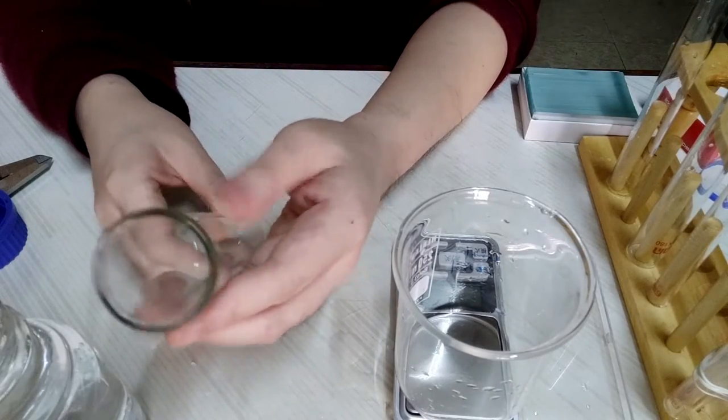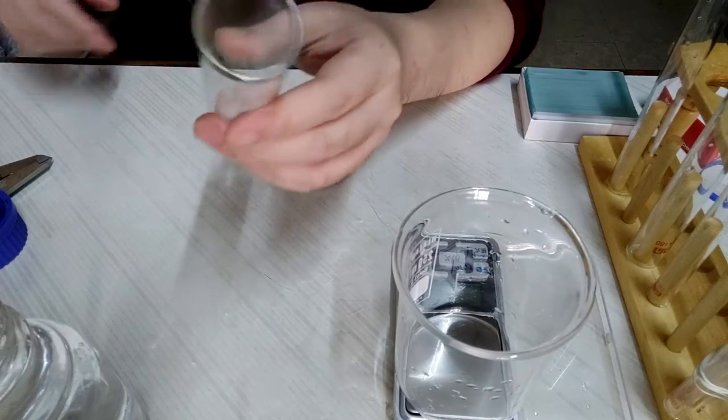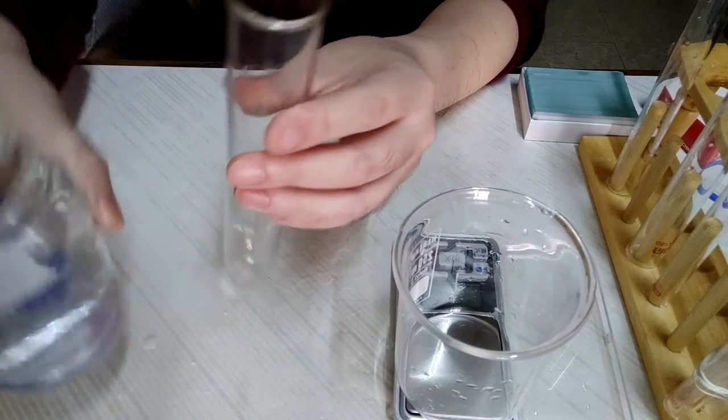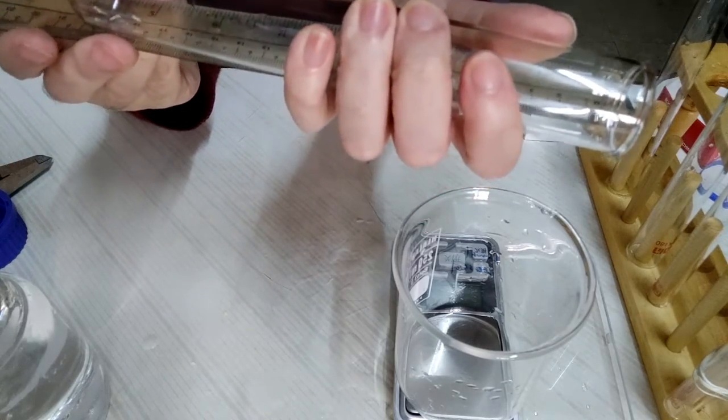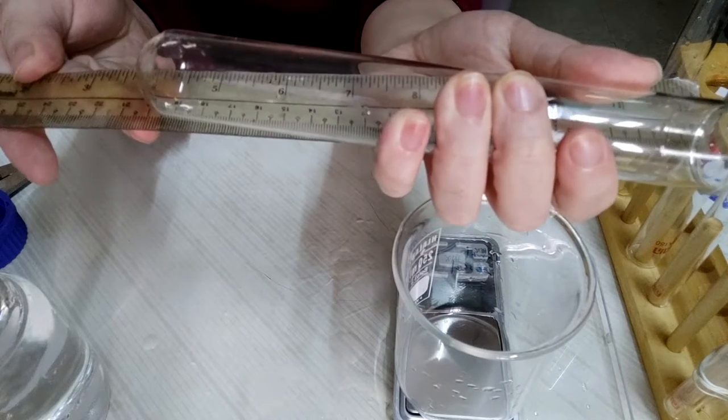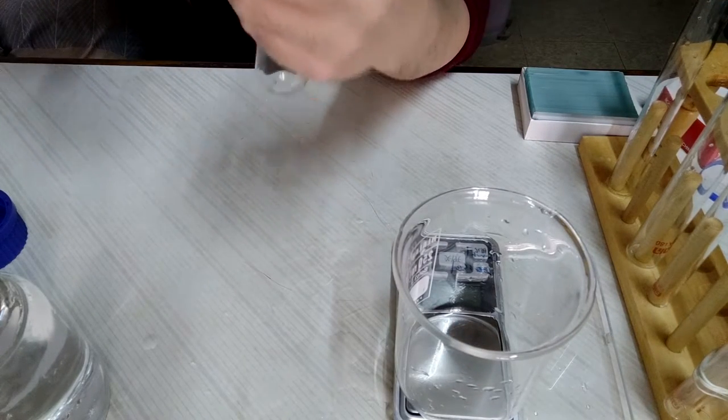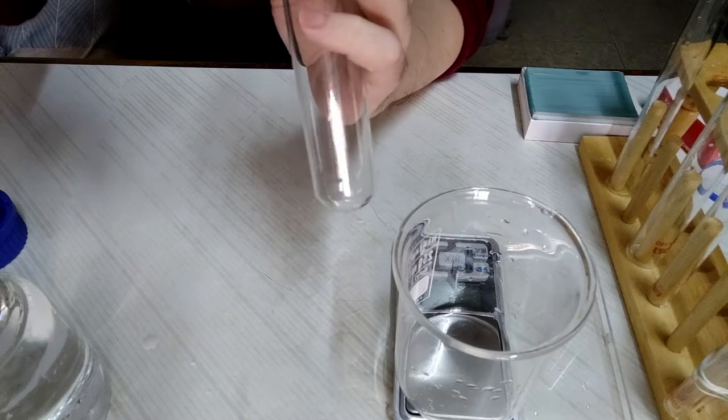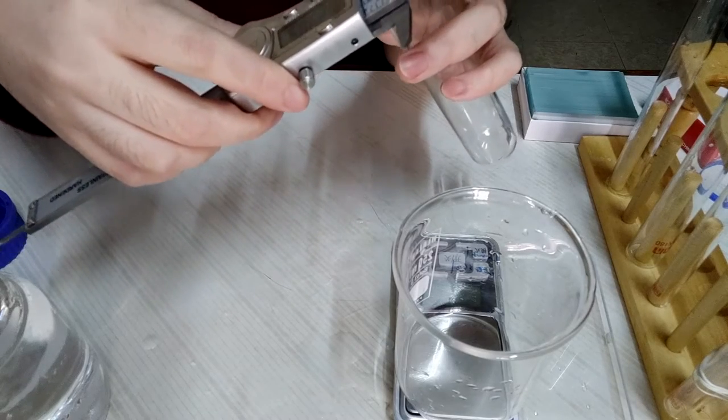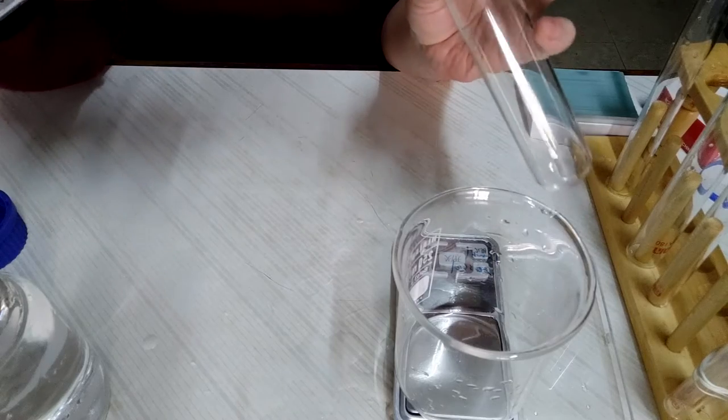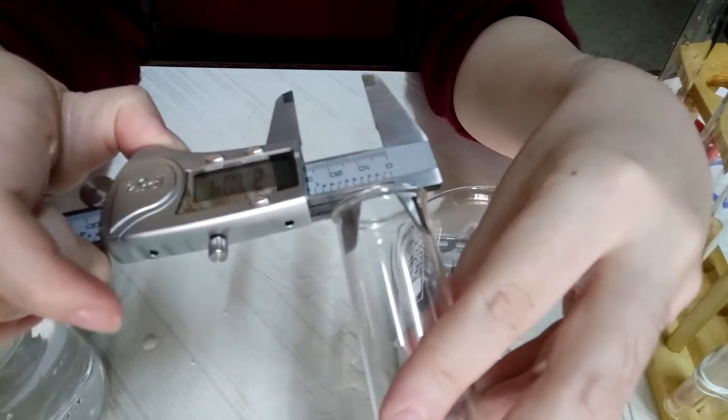And now, lastly, this is really huge. Well, I don't know if you call it boiling tube or test tube. The length here is roughly 20 centimeters. The external diameter is closing into 3 centimeters, and the internal diameter is 27 millimeters.